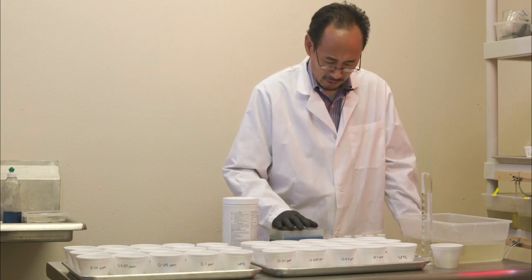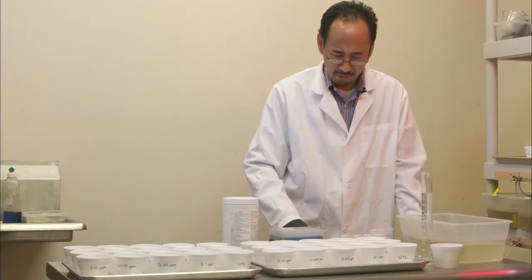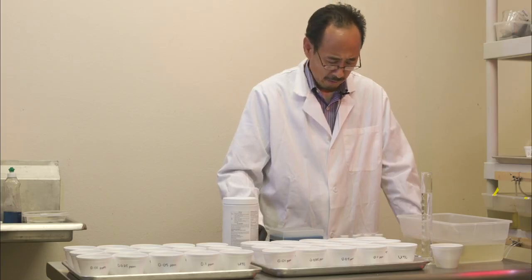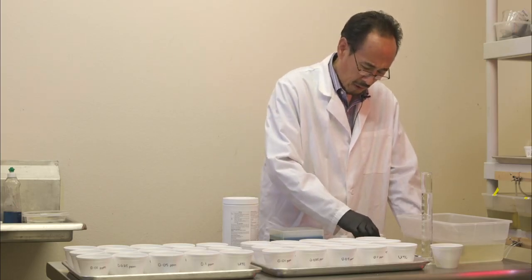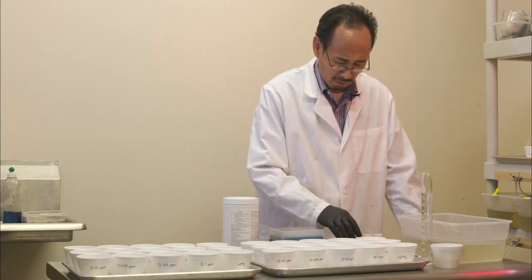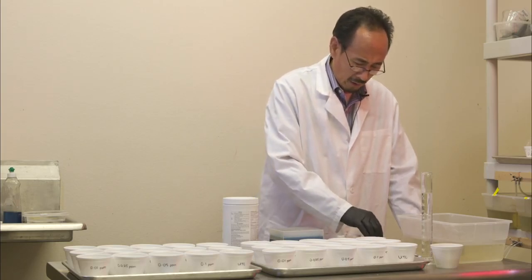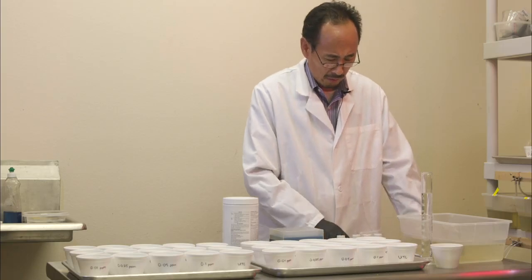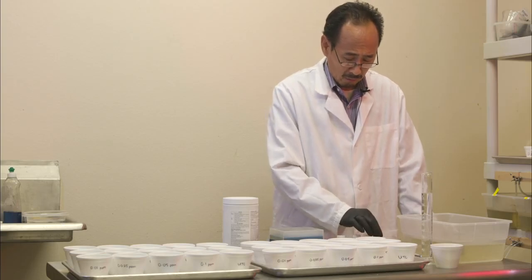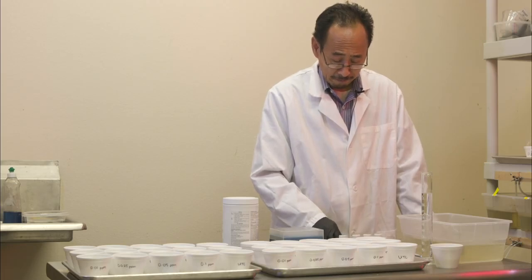And then what you need to do is to make your material the serial dilution. For example, today we're going to use this 3000 ITU per milligram water dispersible granule, or WDG. You would start from 1% and then dilute to 0.1%, then 0.01%, and then 0.001%. So making 1%, I normally use 200 milligrams in 20 ml. And then make it easier is first vial I add 20 ml water, then the second, the third, and the fourth I add 18 ml of water.